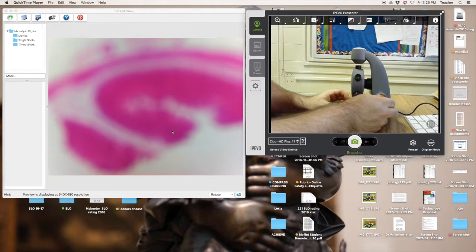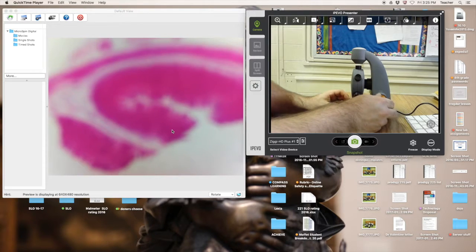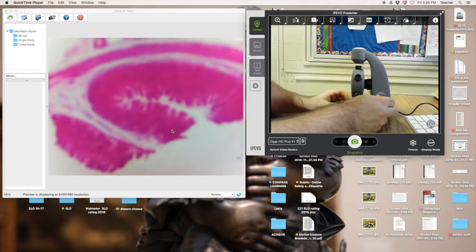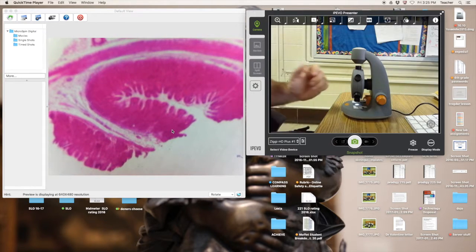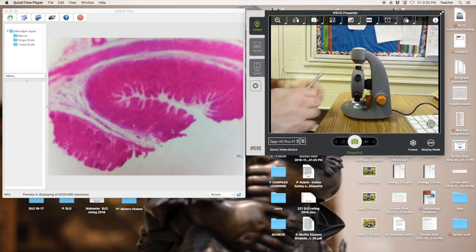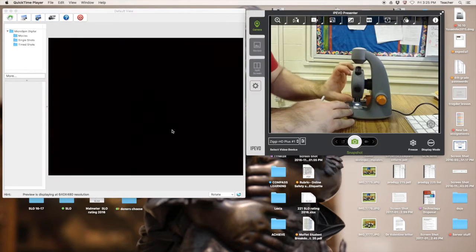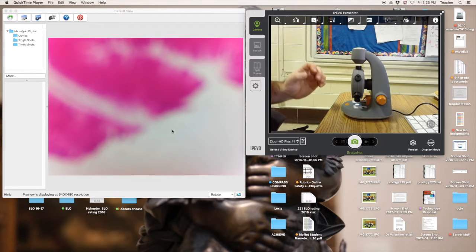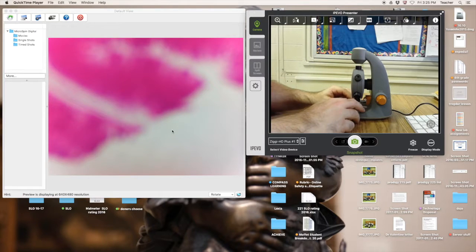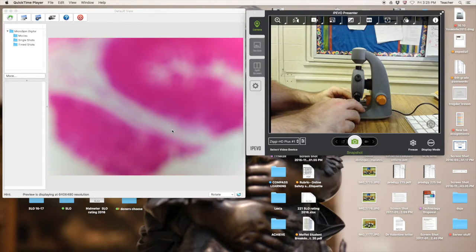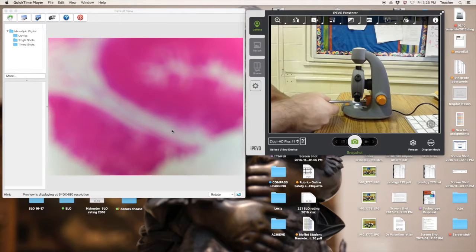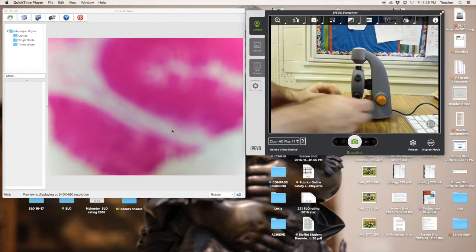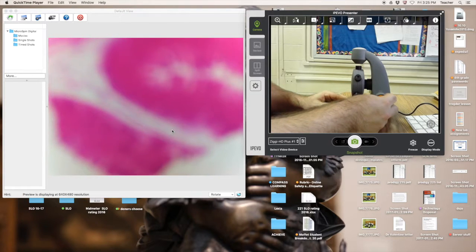It's in focus. Turn again. Notice each time I zoom, you may have to actually physically move the slide to get the area that you wish to view under the white light here in our viewing area. Again, it's out of focus. I adjust, spinning the knob.